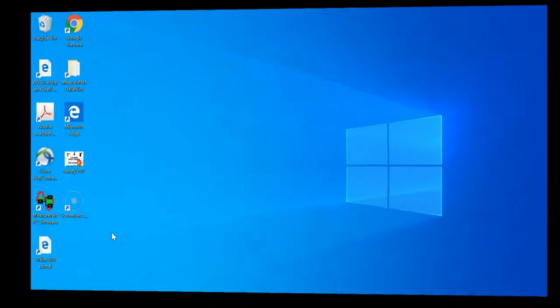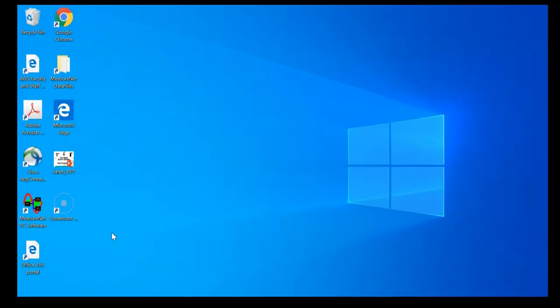So as you're preparing to start your lab, you want to open up from the desktop the shortcut that says MeasureNet PC software located on the left-hand side of the screen. That's going to open up the MeasureNet software, which is going to allow us to take the students' data that they are working with on their station and save it to the laptop. So you're just going to double click on that icon and the software is going to load.